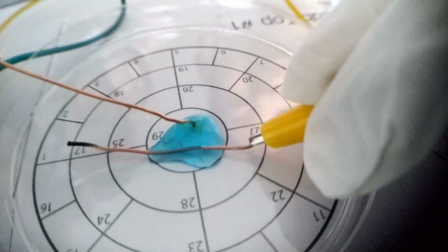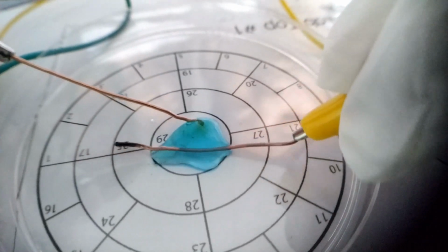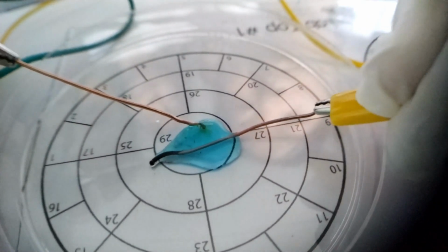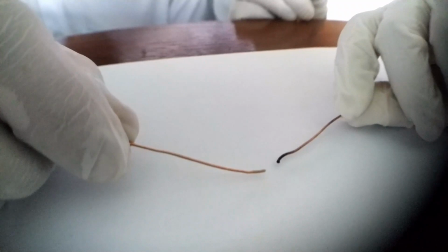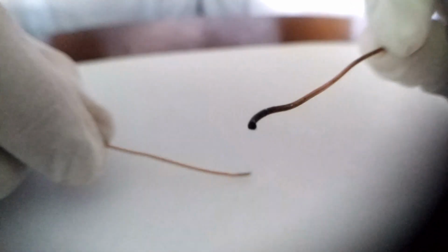Which one will be oxidized, SO4 2- ions or OH- ions? Neither, because the anode, which is copper itself, has more oxidation potential than these two ions. So the copper anode dissolves into the solution as Cu2+ ions as it is oxidized. It will be found that the cathode is getting thicker, and the opposite is true for the anode.